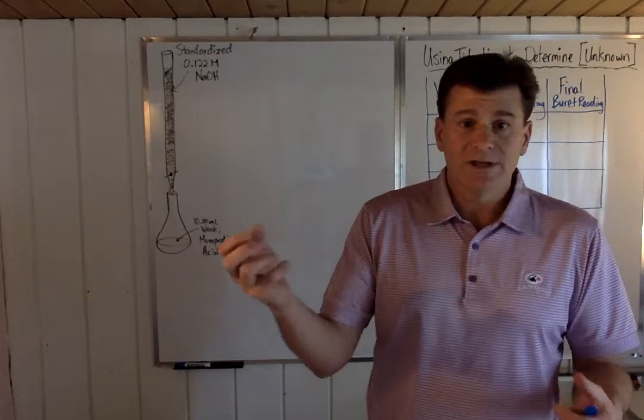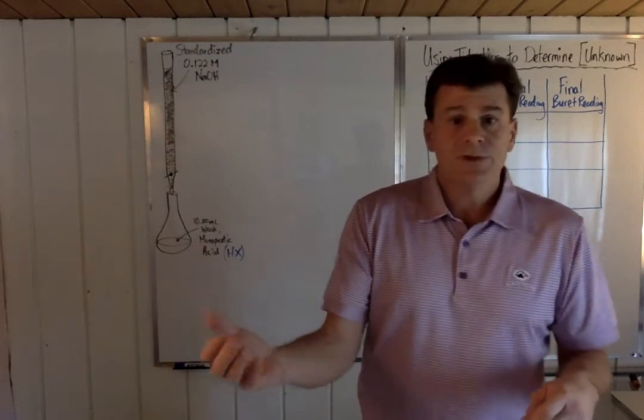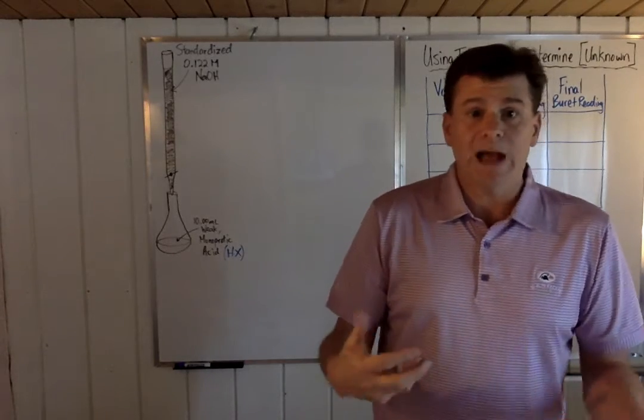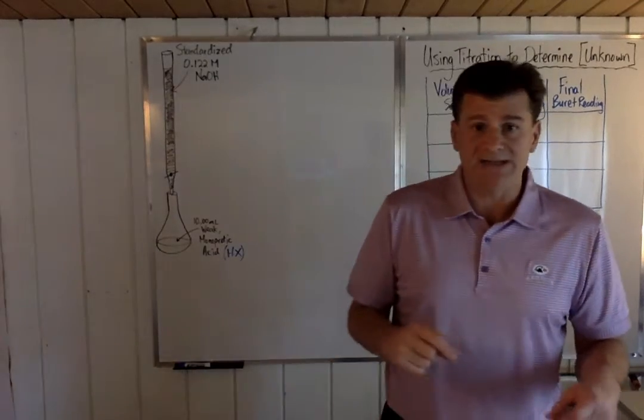Typically what you do is measure the right amount of crystals that you want to make, put them into the volumetric flask, add some distilled water, fully dissolve it, and then continue adding distilled water until it's up to the single mark of the volumetric flask.